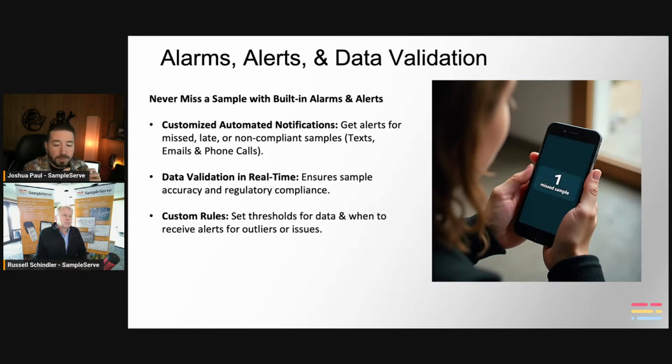So the drinking water people were really worried about missed samples, because that's really huge for compliance. You can't miss these samples. They happen every day. They happen often, and they get forgotten sometimes. It's wastewater too, not just drinking water. Wastewater, they'll collect a sample and then they'll put it in the fridge, and then it just sits there because somebody went home instead of bringing it to the laboratory. Somebody else was supposed to bring it to the lab and they simply forgot. And if it's a bacteria sample, you can't bring it there the next day. It's not a valid sample any longer. So there's no way to go back in history and collect that sample. So they get a violation because they missed that sample.